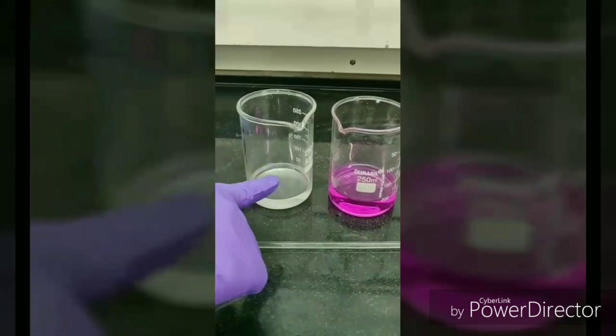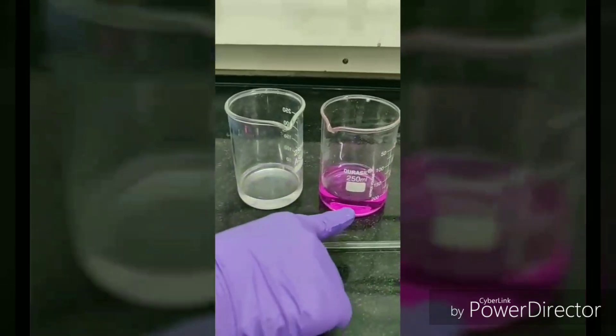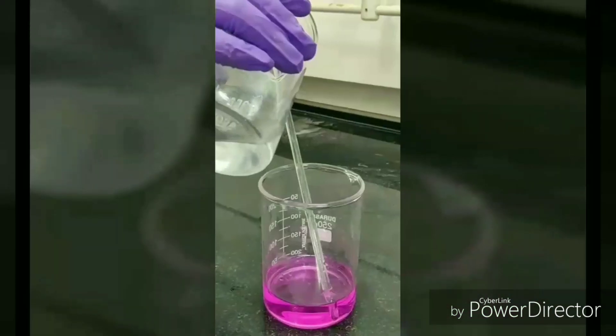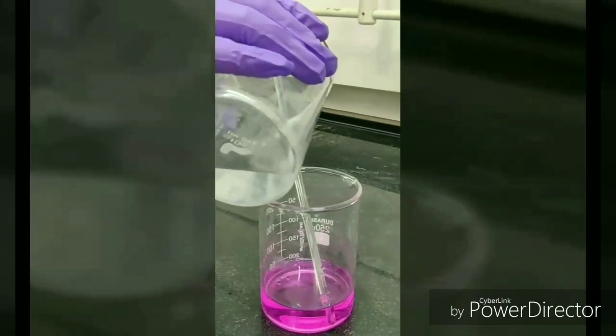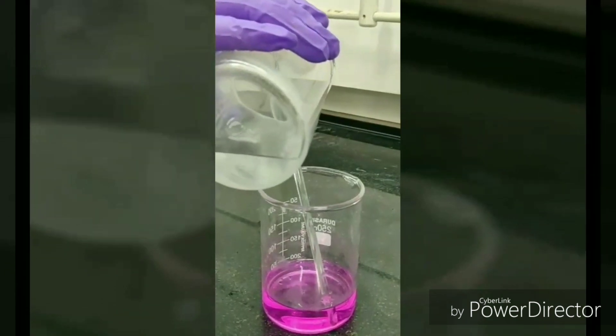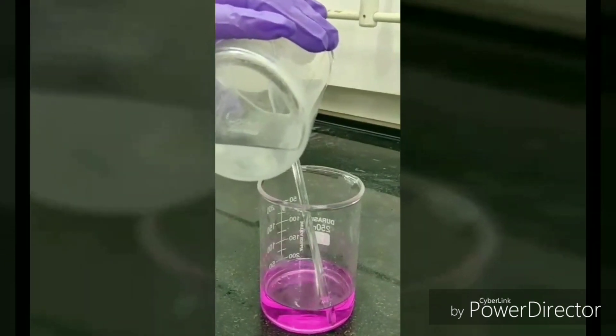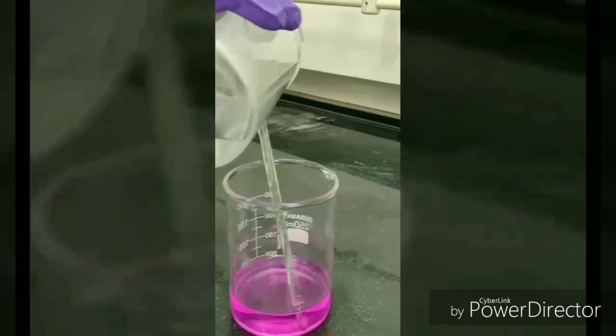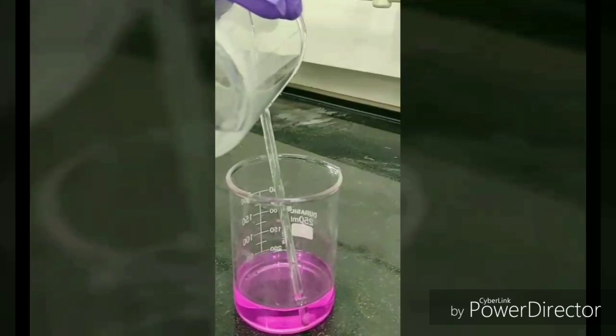Here we have the sebacoyl chloride solution and the diaminohexane solution. The sebacoyl chloride solution is gently poured on top of the diaminohexane solution using a glass rod. This is to be done carefully to get a uniform separation between the two layers.